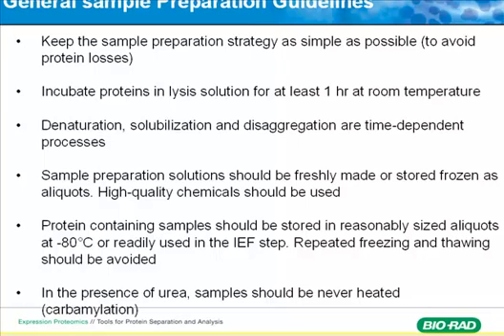Sample prep solution should be freshly made, especially when you have urea. Urea is not very stable — that's the disadvantage of using a urea buffer. It can carbamylate your proteins at the primary amine groups, and the longer you keep your urea buffer, the more carbamylation you'll see. This introduces artificial spots on your 2D gel, so try to use it as fresh as possible.